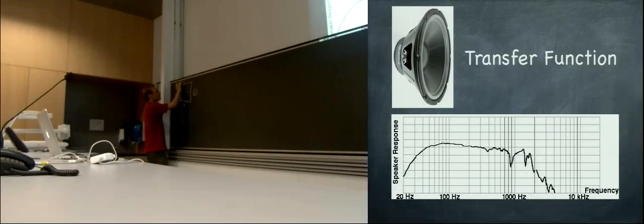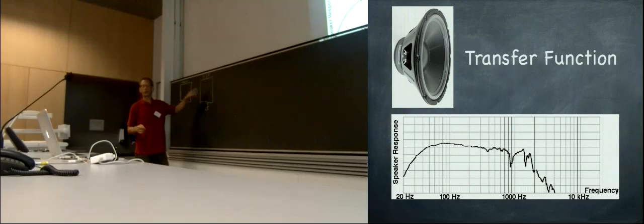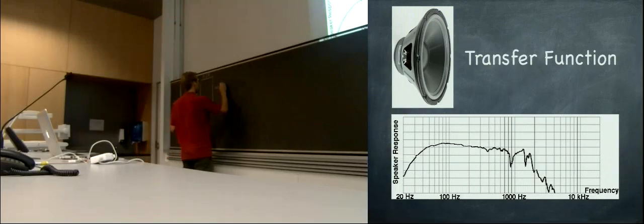Yeah? And this would be our atoms. And we convolute that with another function, g. And this is our point spread function. And this is what the microscope does to the atoms. Then you get our image.